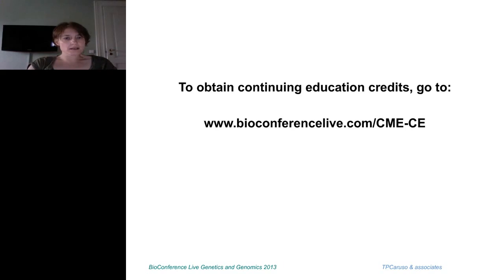Okay, next question coming here is, how can one use next generation sequencing in disease diagnosis where the disease pathogenesis is not associated with gene mutation? Oh, that one is an interesting question. So, for example, it might be due to differential methylation or other regulatory aspects.